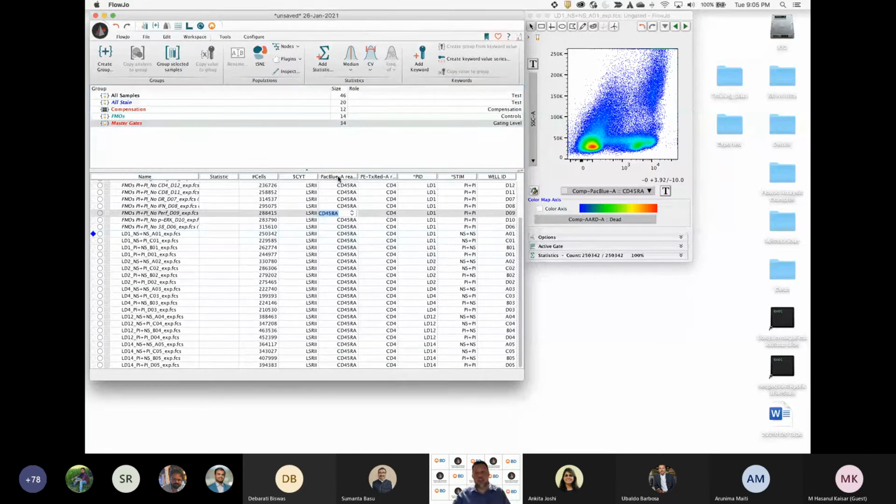And so if you come in and all you have are your parameters within these drop-down lists and no mention of the antigen that you're targeting with your antibody fluorochrome conjugate, then you can display that column, type in once, highlight, and then copy the value to the group. I'll just do that once more. I'm going to go CD8 because this is actually CD8, press return, go back to that cell and copy that value to the group, and it updates to CD8.